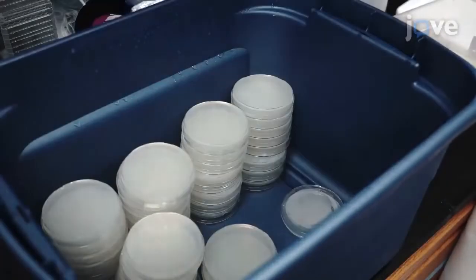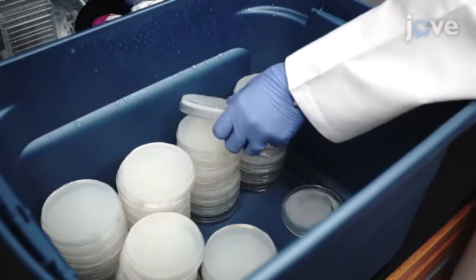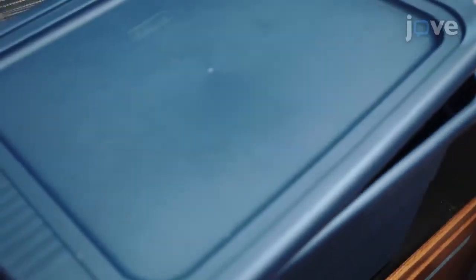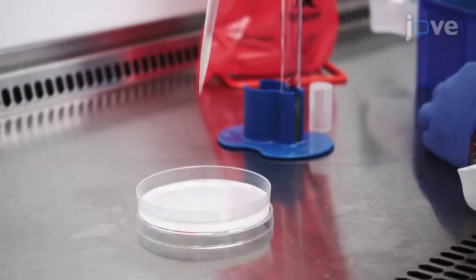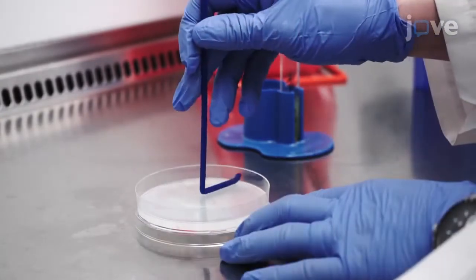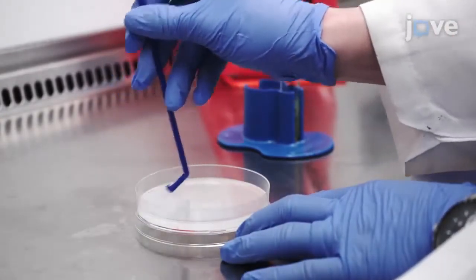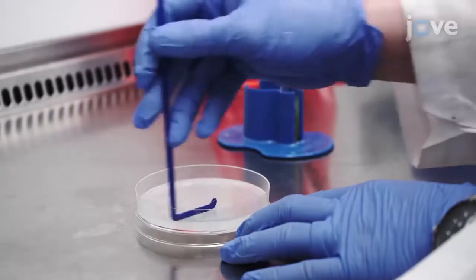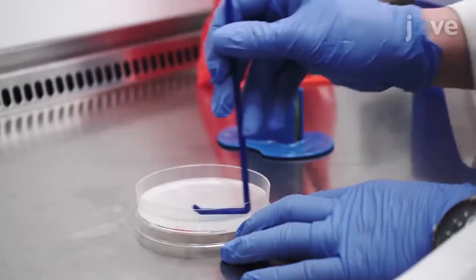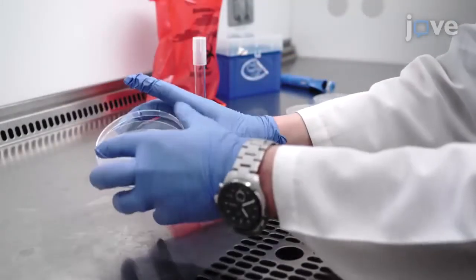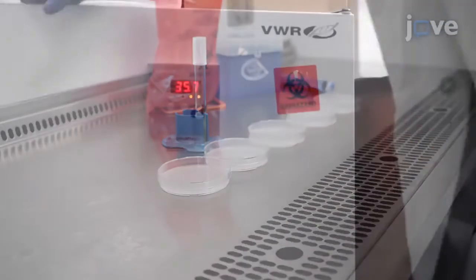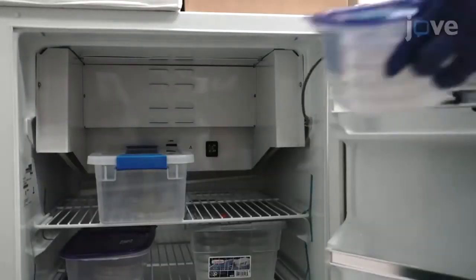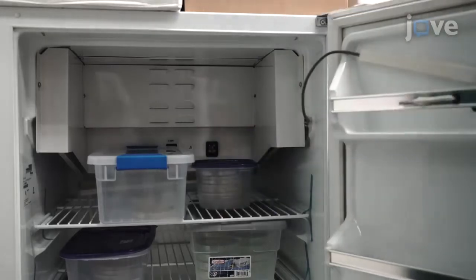After preparing slow kill or SK medium according to the text protocol, seed each 10-centimeter SK plate with 350 microliters of P. aeruginosa from the fresh overnight LB culture. Use a sterile bacterial spreader to evenly spread the bacteria and allow the plates to dry in the biosafety cabinet. Then incubate the plates at 37 degrees Celsius for 24 hours.